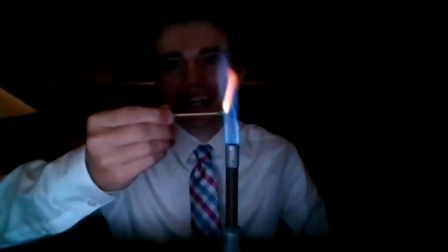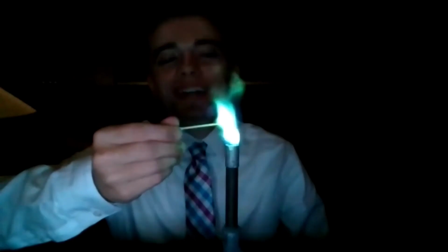All right. When I count to 3 after I burn it, I want you all to shout out what it is. 1, 2, 3. Copper! Copper. That was copper.